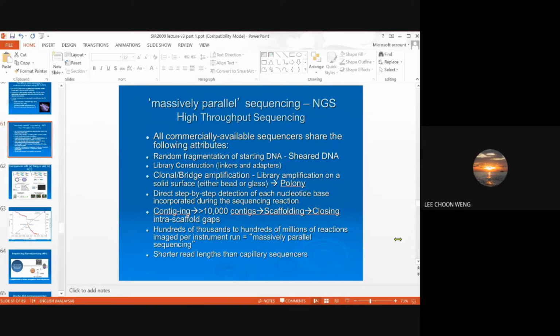Because the database for archaea might not be so strong, so complete, it's good to have your own longer 16S database. So you can still use cloning, TGGE, DGGE, and SSCP, but you have to be very clear about what it can do and what it cannot do.